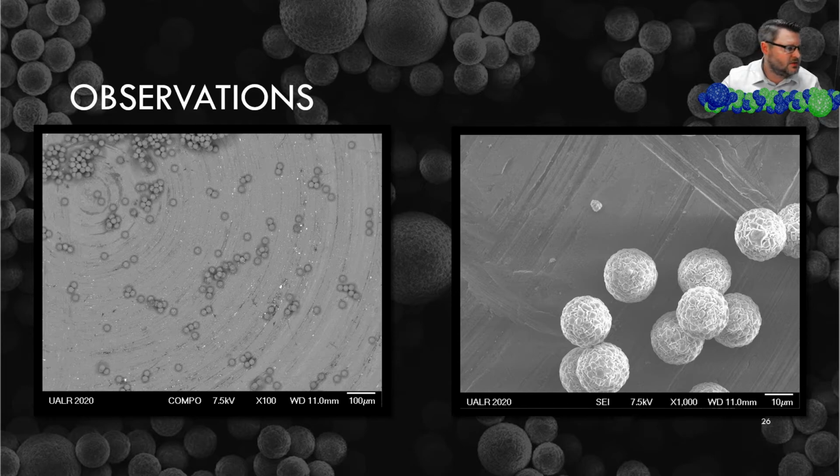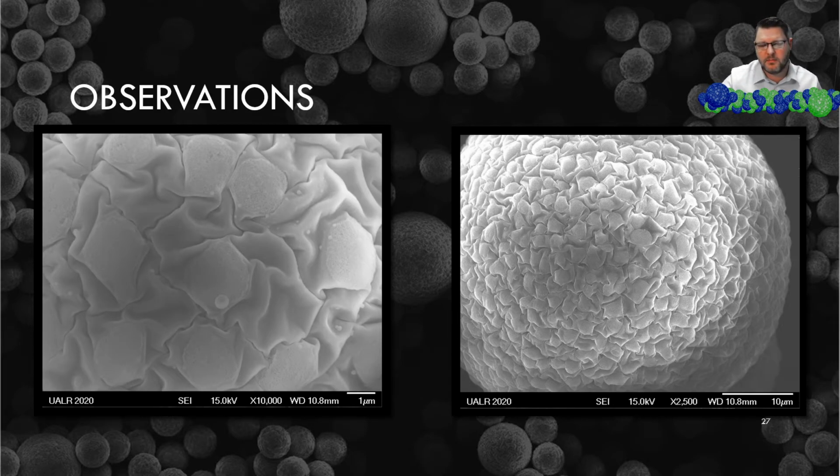Again, more images. First, the one on the left is just 100 times, the one on the right's 1,000 times. Really, really good images. I'm really, really happy with the way everything turned out. So I'm going to keep going.